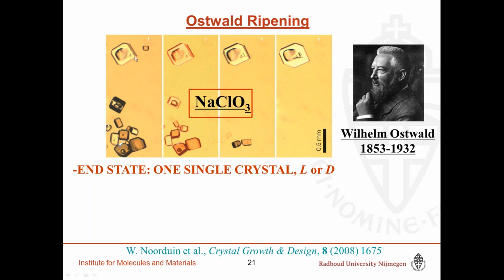But once more, going from the metastable phase, solution, slurry, to this case takes a very, very, very long time if you don't do anything else than simply wait, and that is what you do when applying Ostwald ripening.